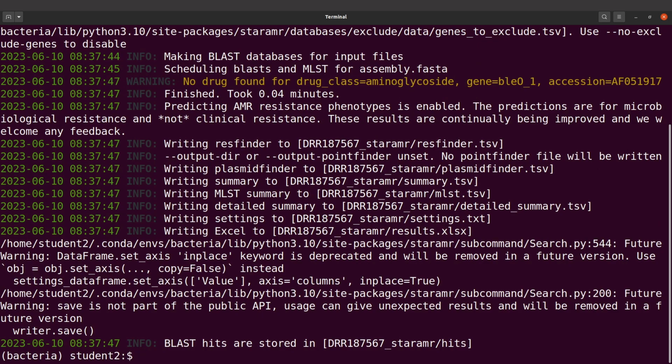All right, so everything has been done. With this one, you can ignore it, that's fine. It's nothing to get worried about. Okay, so we have been able to successfully execute STARAMR. I repeat, we have been able to successfully execute STARAMR.